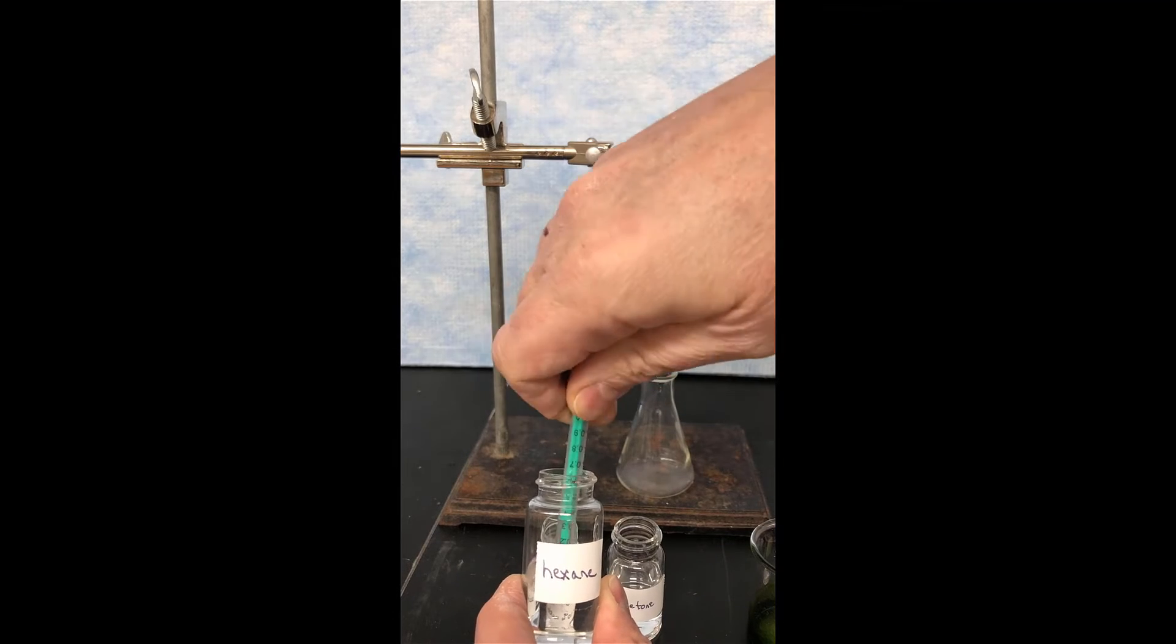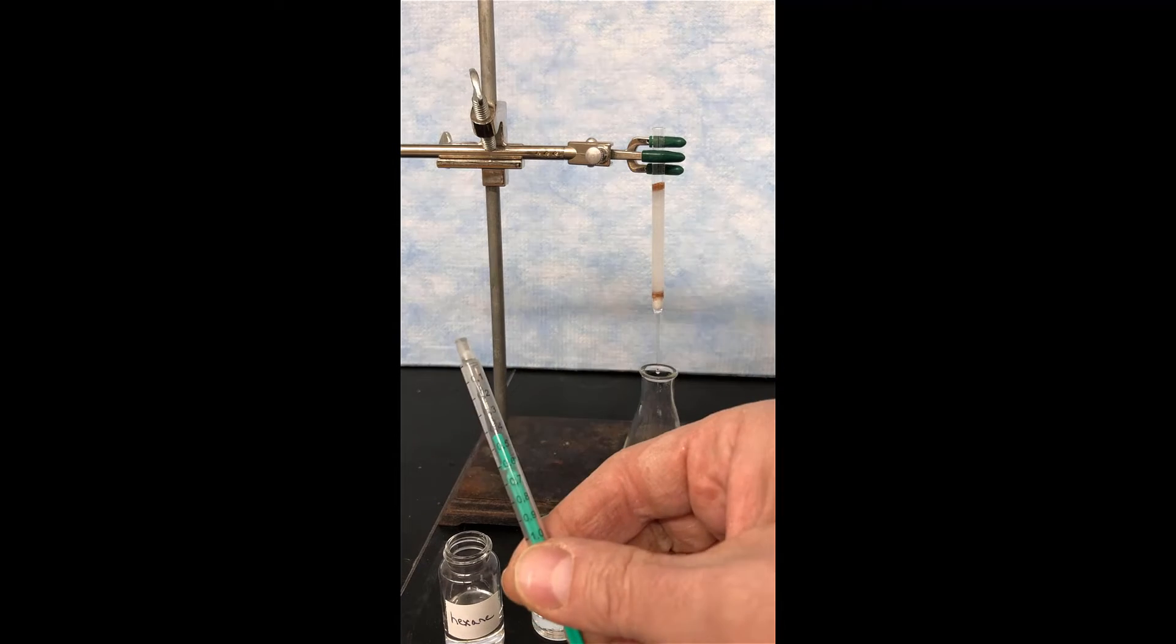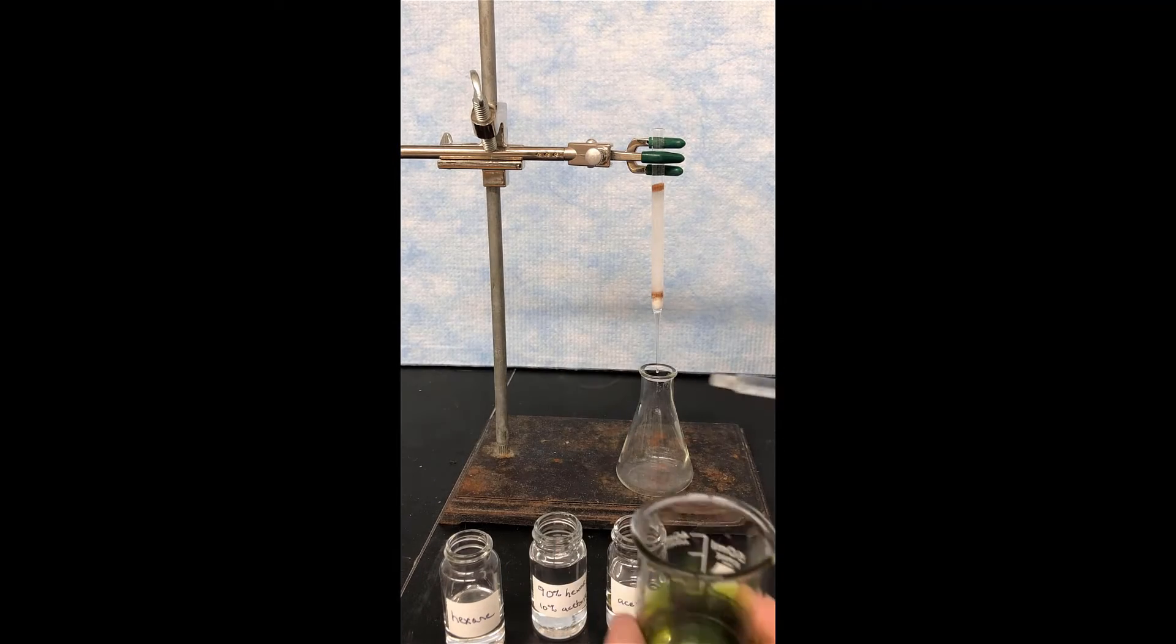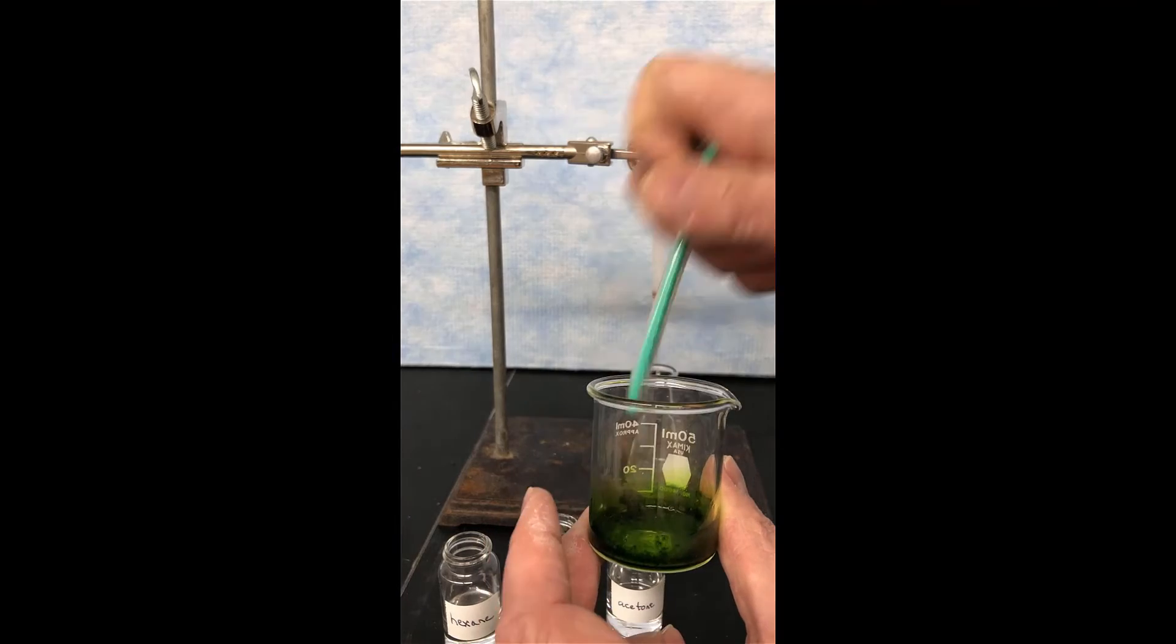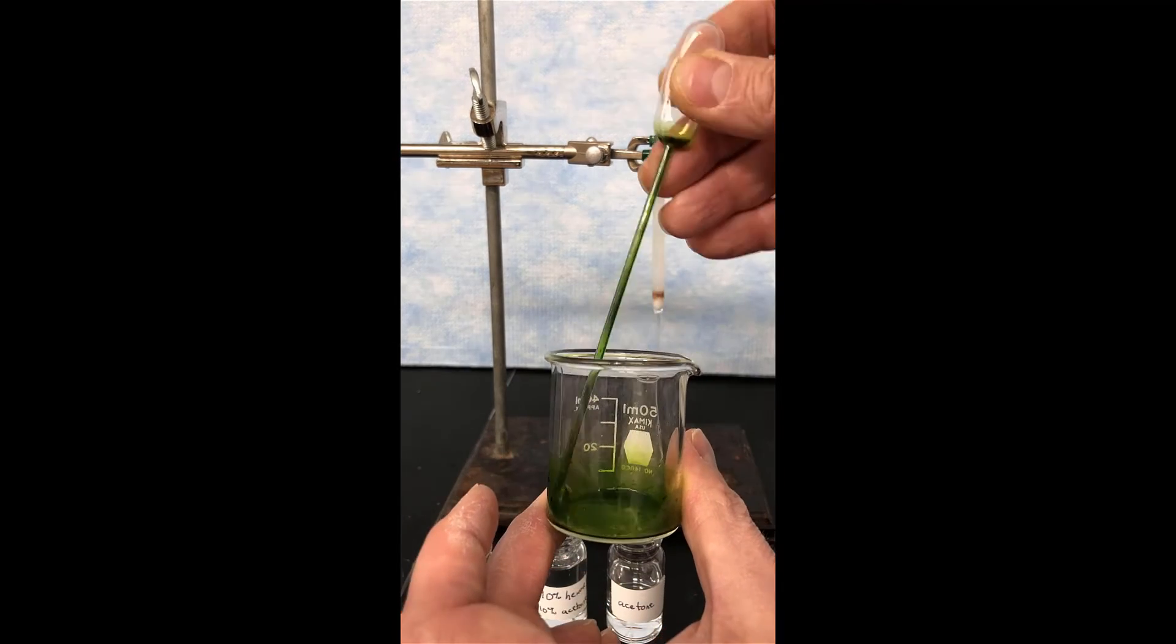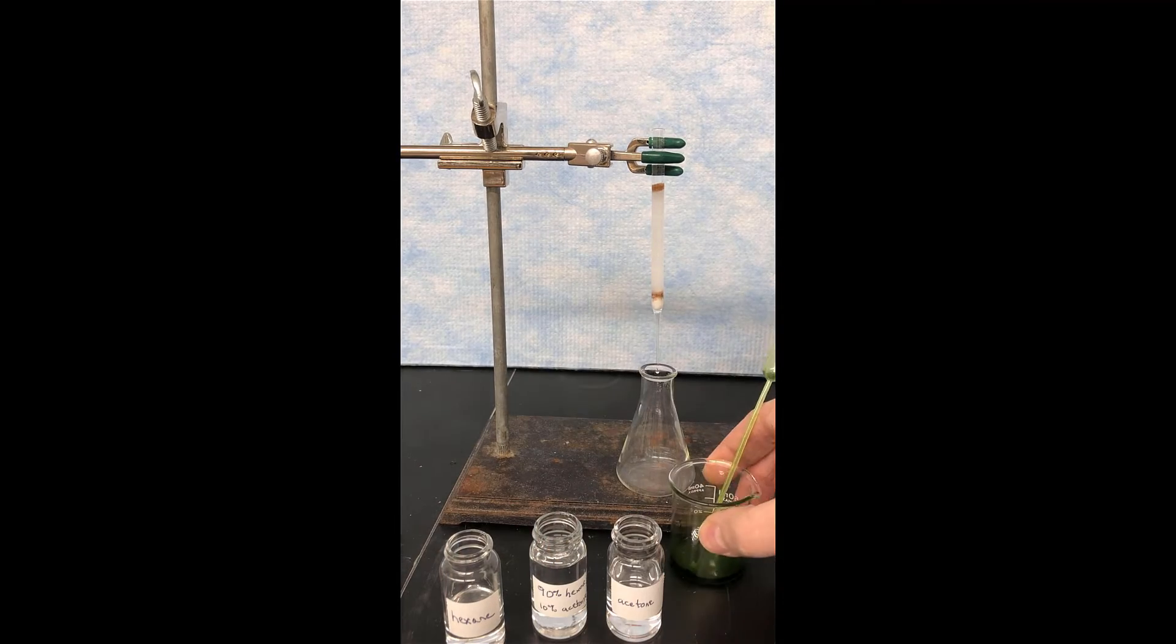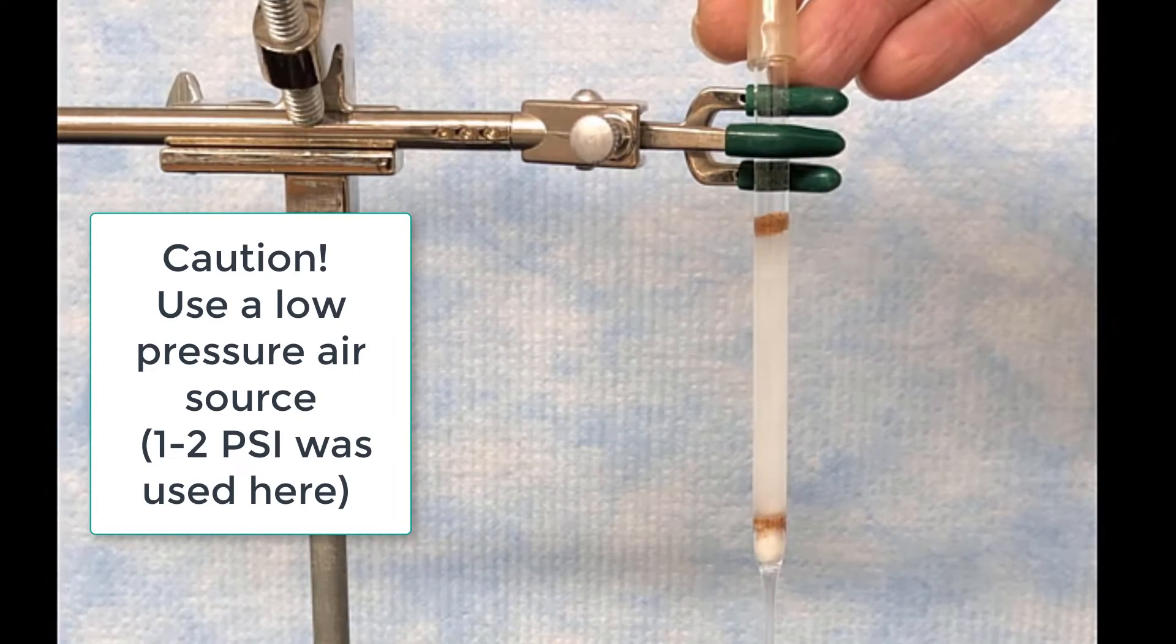So next, we're going to add some hexane to our crude pigment solution. So about a half a milliliter of hexane is going to get added to the crude pigment solution that we prepared in the extraction part of the experiment. So swirl that around with a pipette, get it all dissolved up, then take that solution and pipette it onto the top of the column.